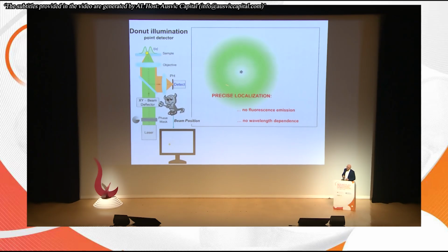And of course, the donut zero is something like a point, yeah? It's a singularity. And what we do here is we match 2 points. And therefore, it doesn't really matter what the wavelength is. So here, the donut zero could have been made with green light, yellow light, blue light, red light, microwaves, X-rays, whatever. In the end, we just care for the point, and therefore the dependence on the wavelength is gone.